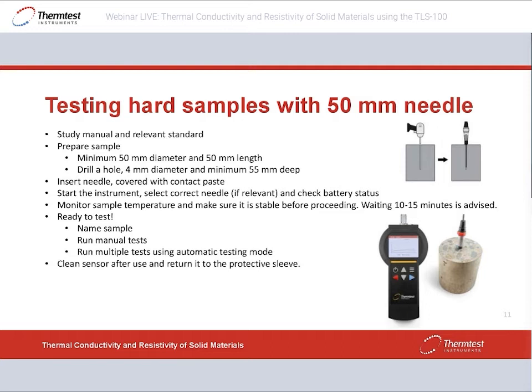Once you have the needle in, we can start up the instrument, make sure that the correct sensor is selected. If relevant with a new design, you don't have to worry too much about that. Check your battery status so you don't run out of battery during testing, of course. Once that's done, take a look at the temperature, because the machine will continuously monitor the temperature of the probe. And now your probe is inside the sample, so that means that we measure the temperature inside the sample.